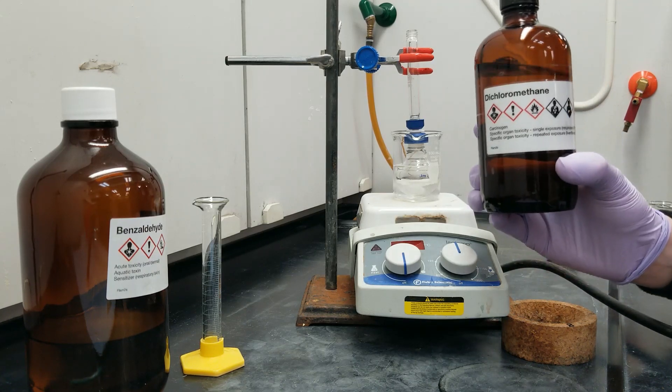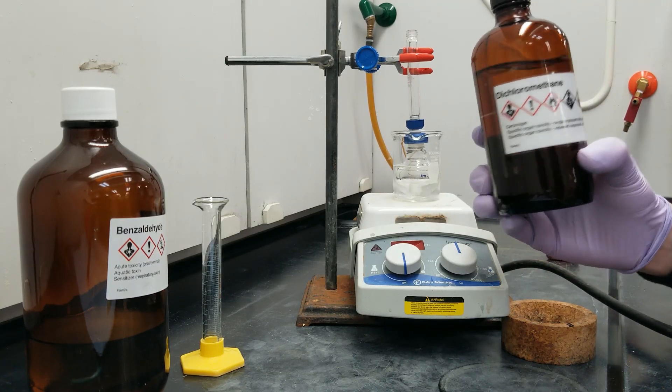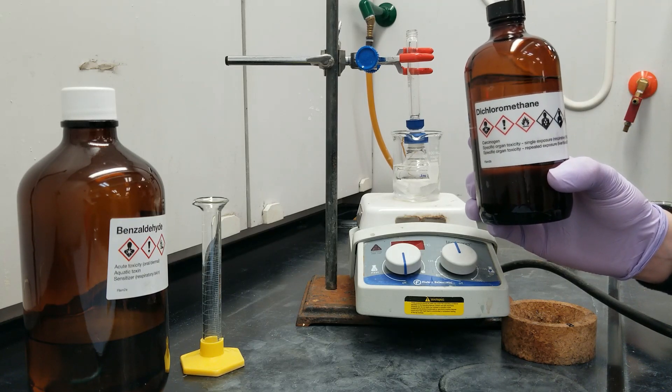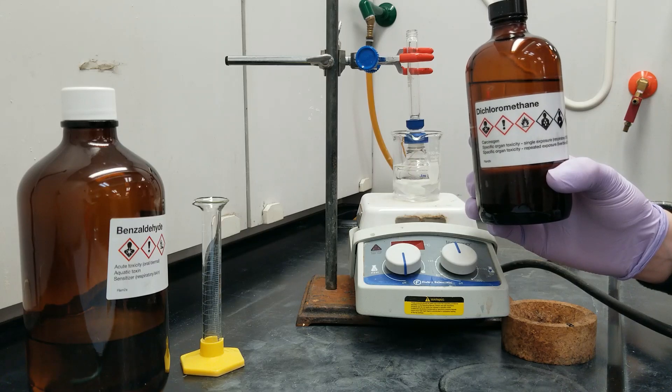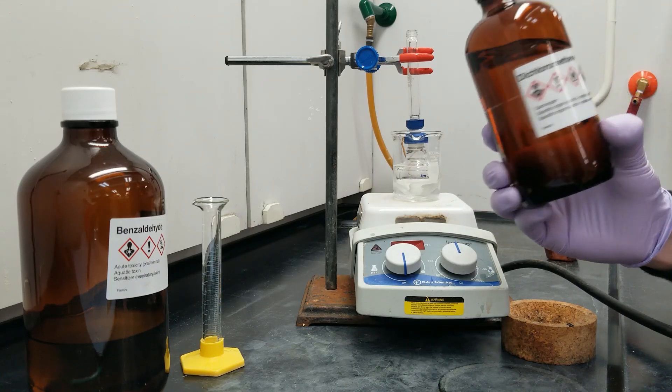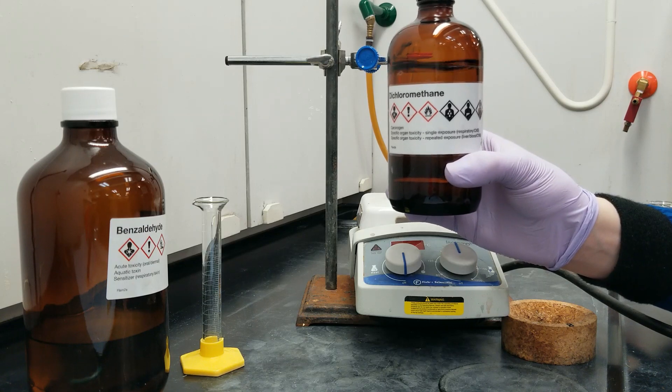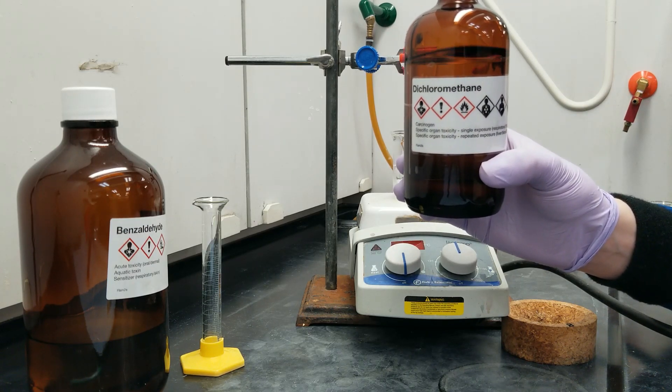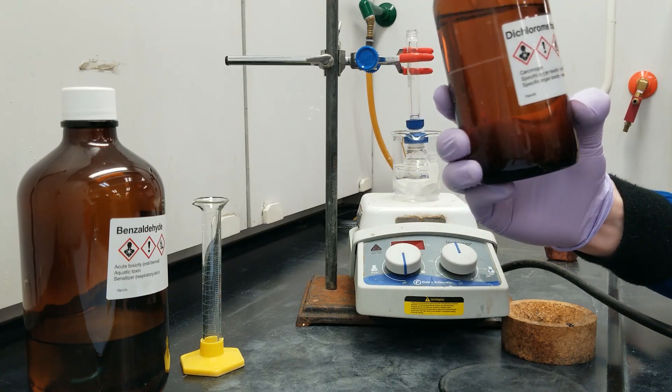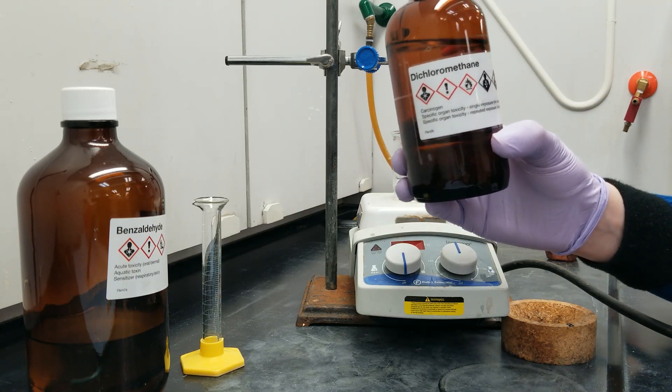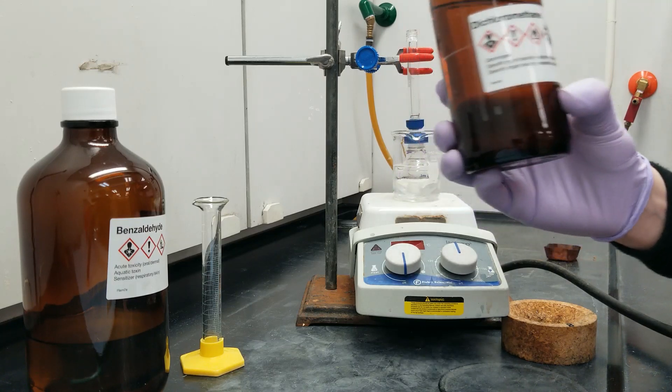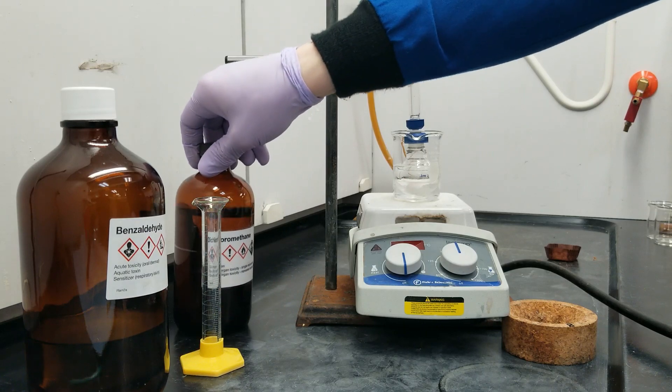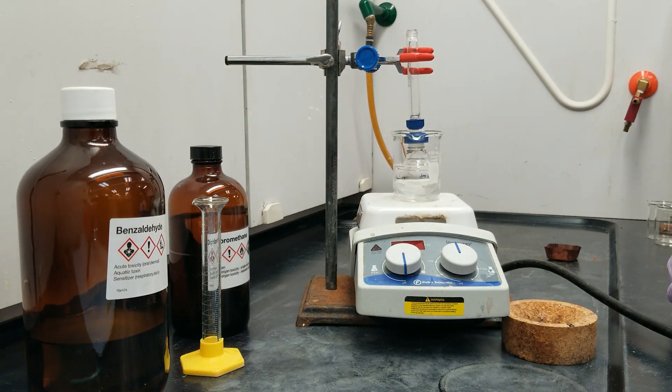Let's talk about DCM. DCM is a great solvent. It dissolves lots of things, has a slight polar moment, and is aprotic so it doesn't mess with acid-base reactions. But look at all of those hazard labels. This thing is a powerful known carcinogen and needs to be handled carefully, along with flammable and many other biological effects. So something can be handled carefully but not avoided as long as you take the proper precautions.